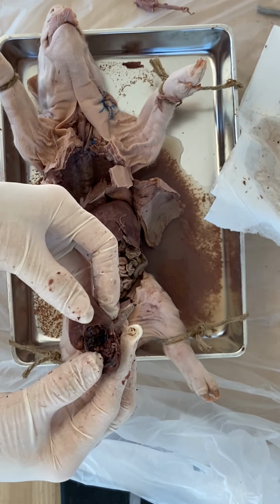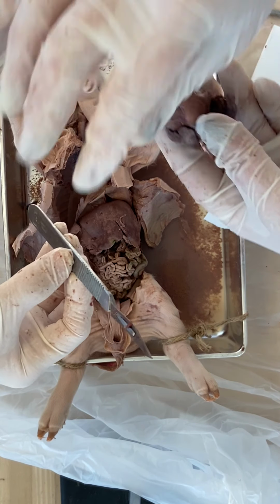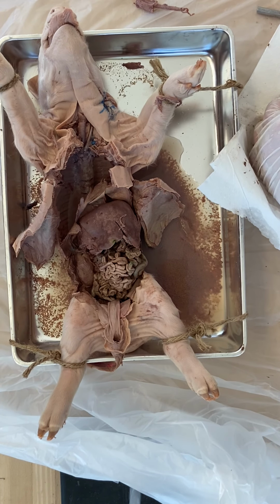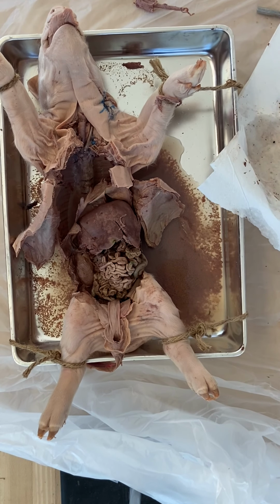Should we try slicing like we did with the one yesterday? Yes. Want me to do that? Okay, I'm going to put it down on the desk. I'm going to slice as if we were looking at the diagram that we've been using, to see if we can see the division of the two ventricles. We could yesterday very nicely.